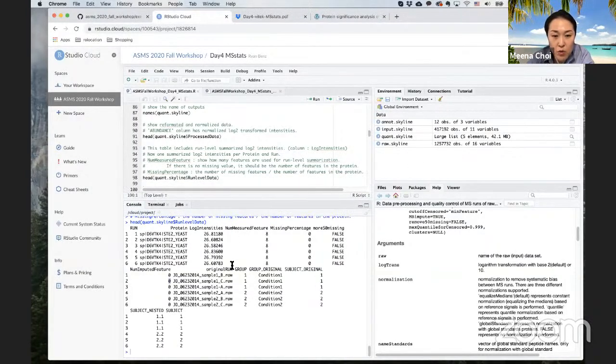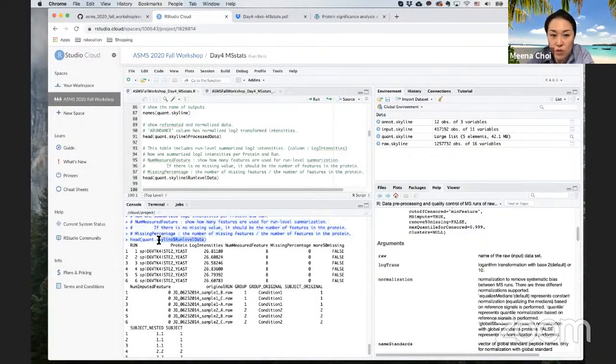If you want to go further with something else, just use MSstats for the protein-level summarization. This output is what you have to use. And yesterday, what we practiced, the protein summarization, used this data set, not the output from the processing tools.